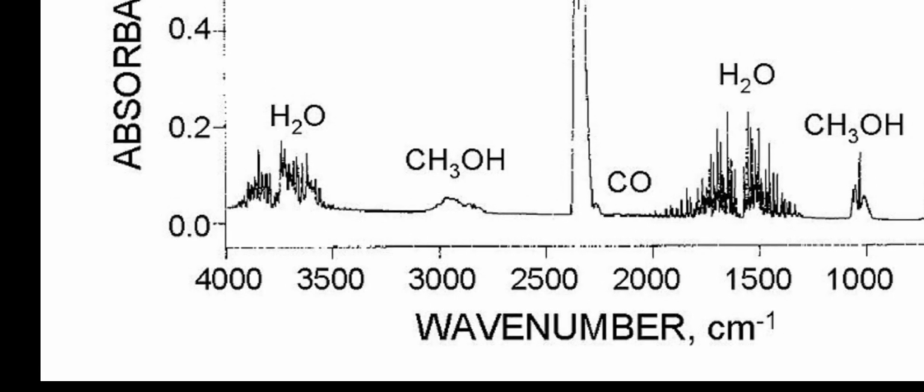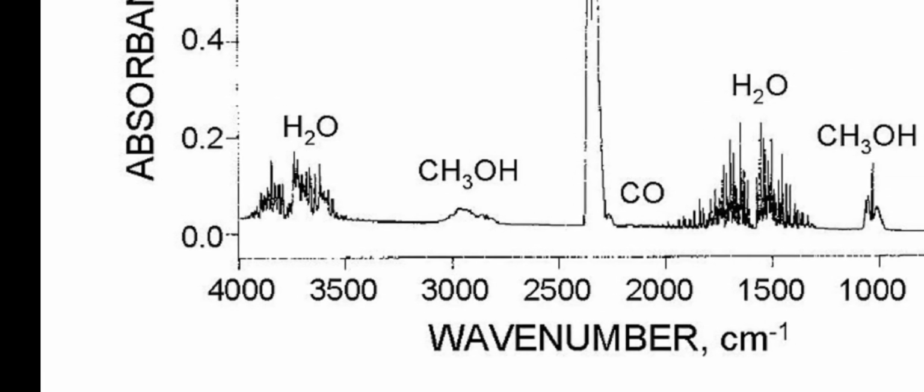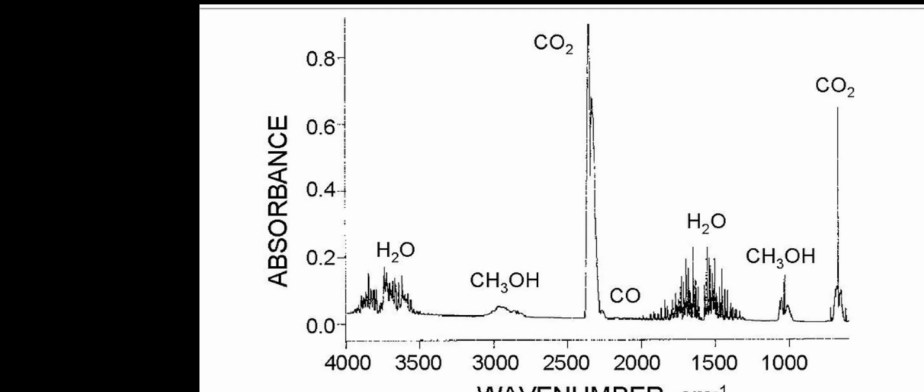And as for methanol, the graph is very low as it is less polar than the water, and that's why its graph comes around 3000 centimeter inverse.